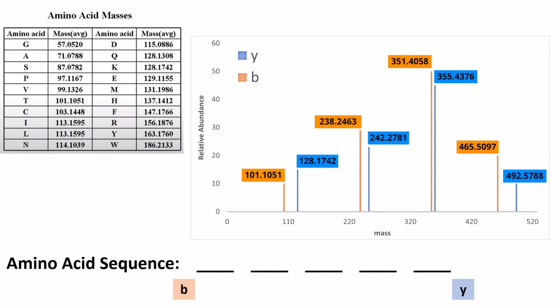We always want to start with the peaks with the lowest mass value. Remember, the height of the peaks do not mean much at this stage, but what is important is the mass value. These values are recorded above each peak in our simplified graphs. The reason we start with the smallest peaks is that we can assume that these are single amino acids. Larger mass values are more likely to be a combination of amino acids, so we want to start with the smaller values and build to interpret more complex values in sequences.